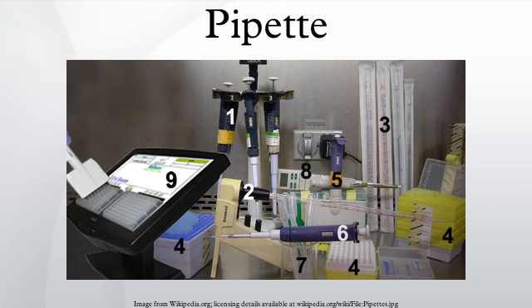Glass micropipette. These are used to physically interact with microscopic samples, such as in the procedures of microinjection and patch clamping. Most micropipettes are made of borosilicate, aluminosilicate or quartz with many types and sizes of glass tubing being available. Each of these compositions has unique properties which will determine suitable applications. Glass micropipettes are fabricated in a micropipette puller and are typically used in a micromanipulator.